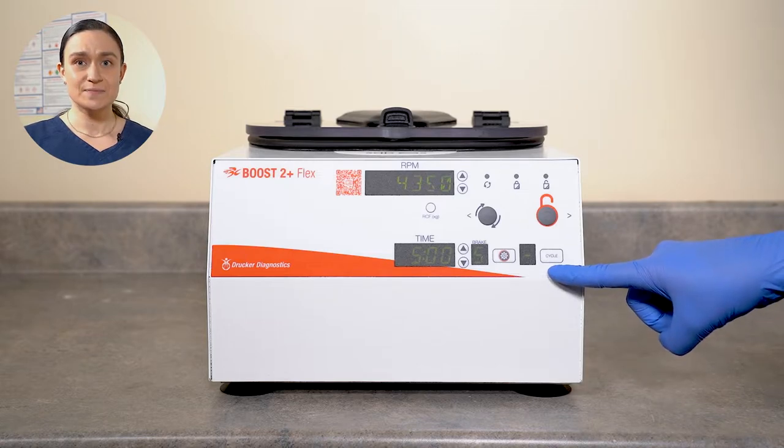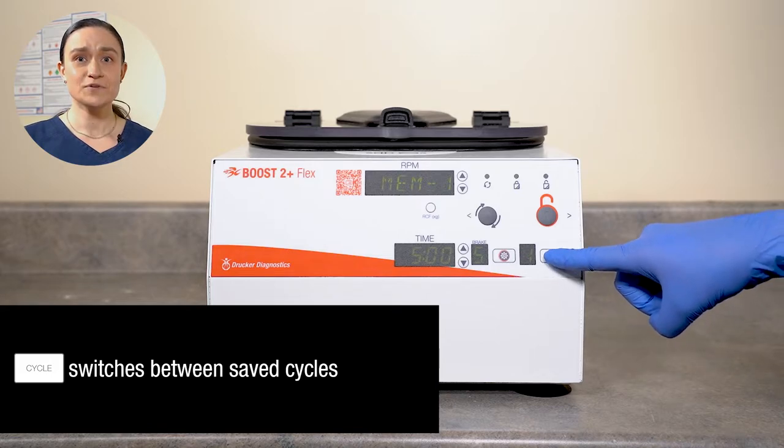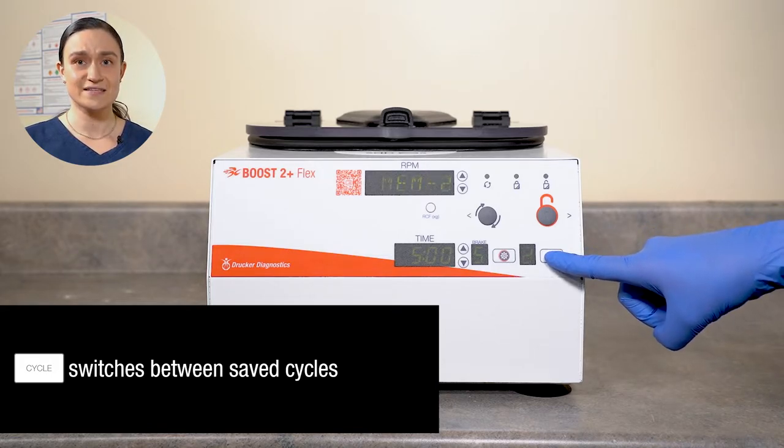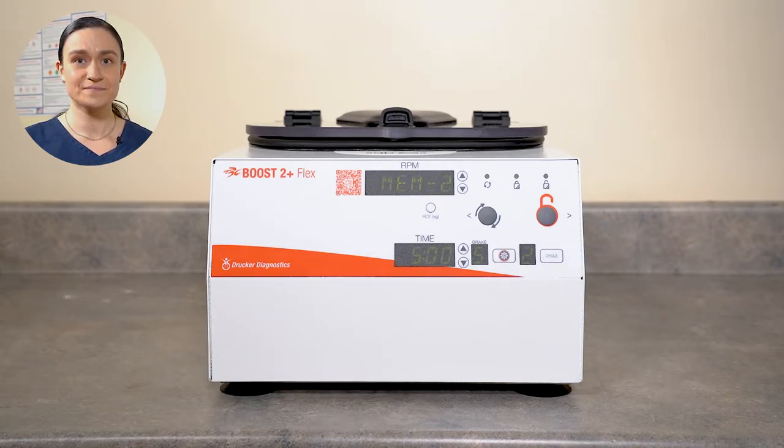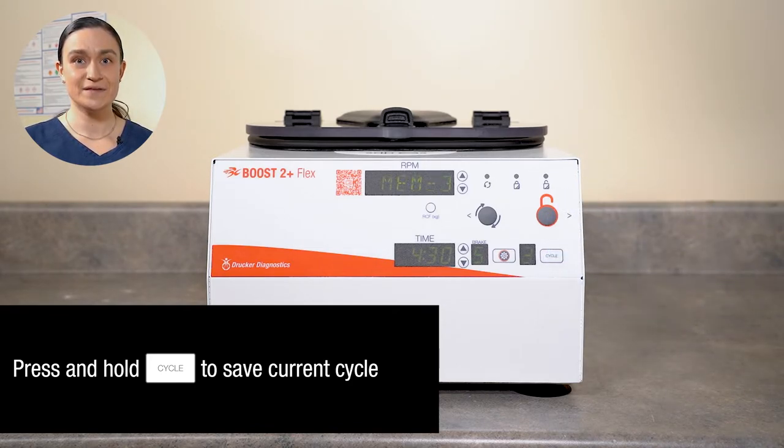The cycle button has two purposes. If saved cycles are created, the cycle button can move through them — simply press it and it will rotate through any saved cycles you have. Additionally, the cycle button can be used to create new saved cycles. Simply program the speed, time, and brake values as desired, and once they're showing up as you want them on your screen, press and hold the cycle button. A new cycle will automatically be created. And those are your controls.